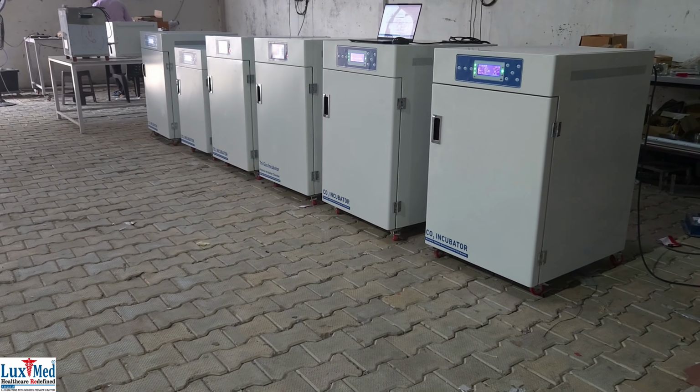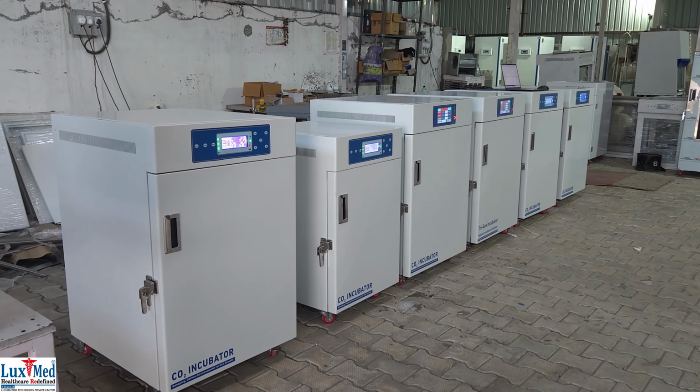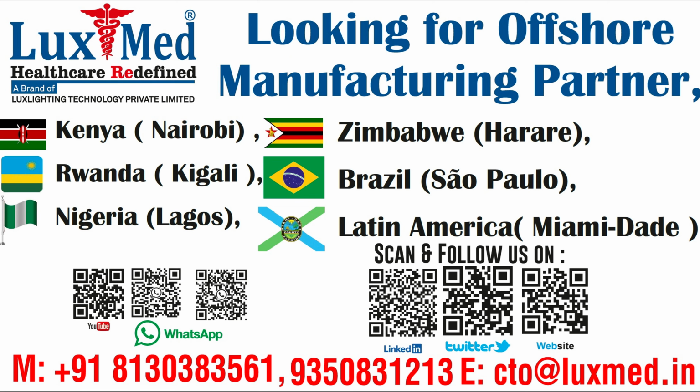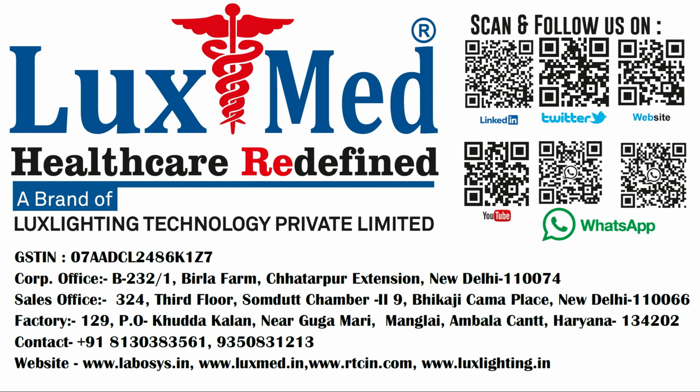Tissue engineering. They are essential for creating artificial tissues and organs in tissue engineering applications. Diagnostic testing. LuxMed CO2 incubators are also used in diagnostic laboratories for various tests and assays.